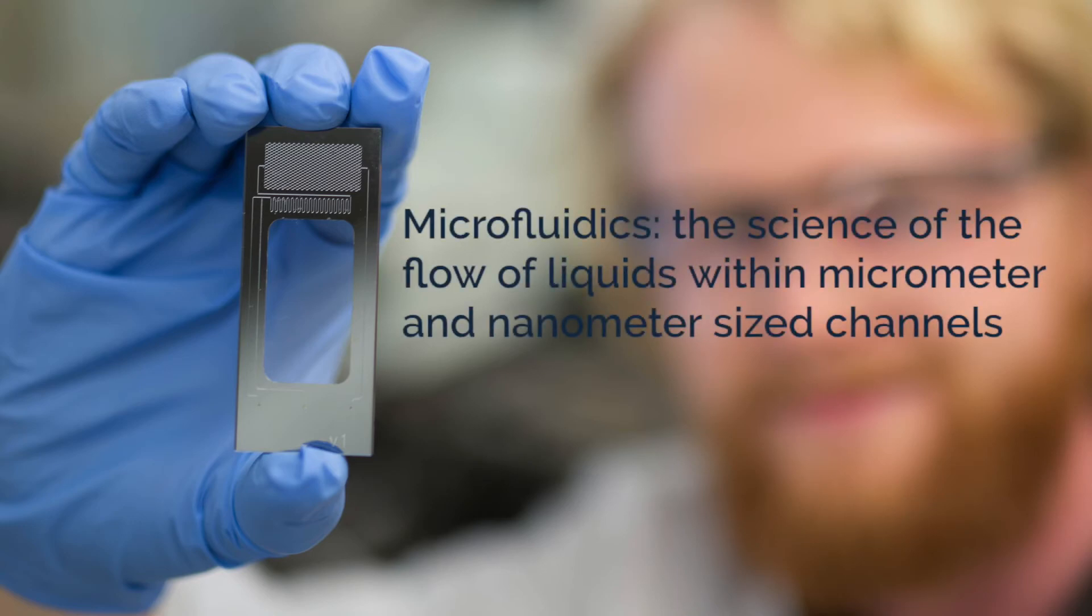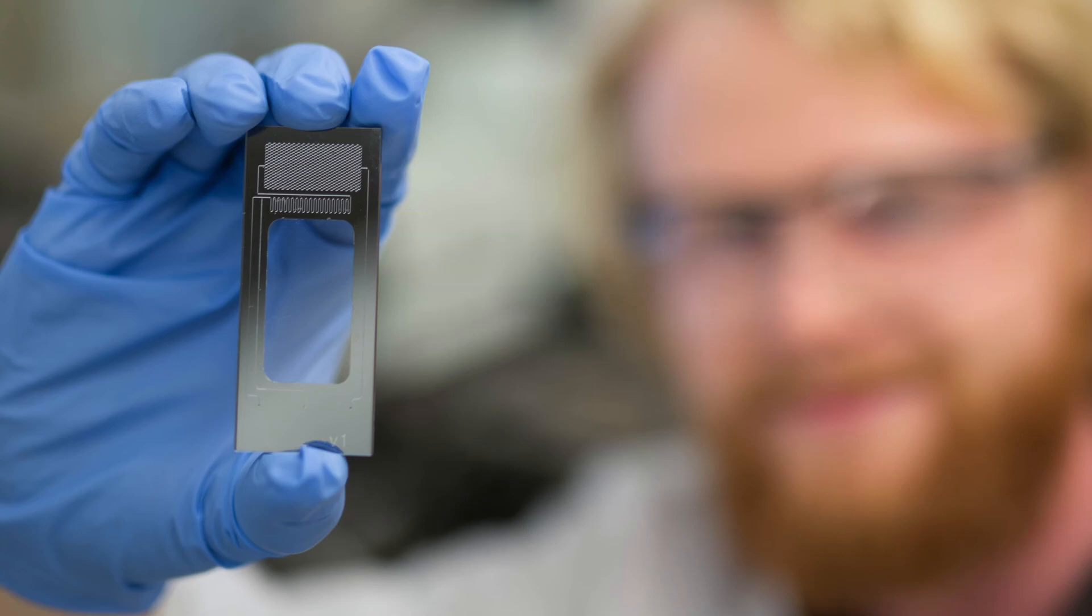Microfluidics is the science of the flow of liquids within micrometer and nanometer sized channels. At Interface Fluidics, we create microchips that model oil and gas reservoirs to better understand how fluids will behave in reservoir conditions.